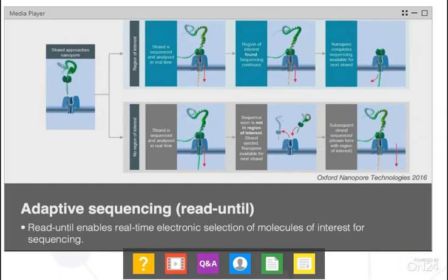Now, because our CAPTORs are the first sequences that pass through the nanopore, they can provide an initial indication as to whether a read is good quality and whether the nanopore should continue to sequence it or not. And if the CAPTOR, which is the first sequence, provides an initial indication of poor quality or a duplicated read, the nanopore can prevent it from being sequenced. And the benefit is that we can integrate this per read data provided by the CAPTORs with adaptive sequencing to provide dynamic control of nanopore sequencing.